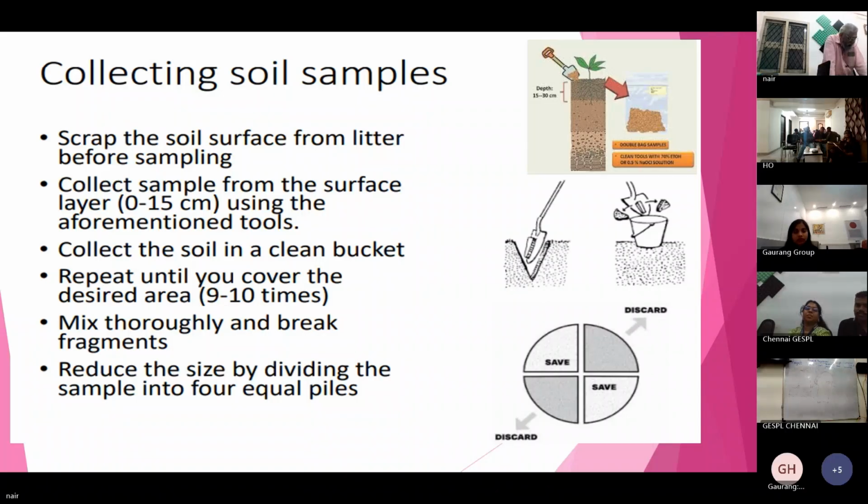Okay. Yes, sir. Sir, I have one more question, sir. When is composite sampling required, sir, in case of water? Usually we go for grab sampling. Composite sample is okay.